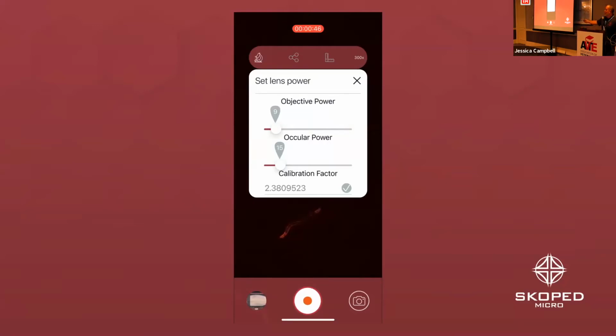But if you buy one, which I hope everybody will eventually use one of these, if you want it literally micron to micron, and you have a microscope or a micrometer slide, you just increase this number to make it bigger, and you decrease this number to make it smaller.